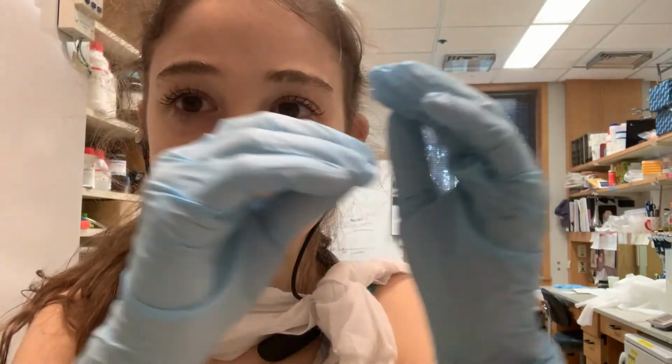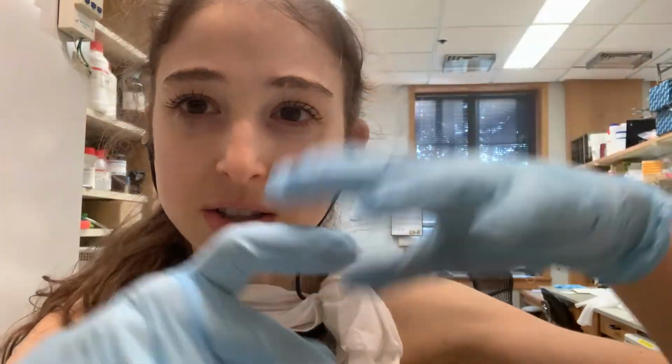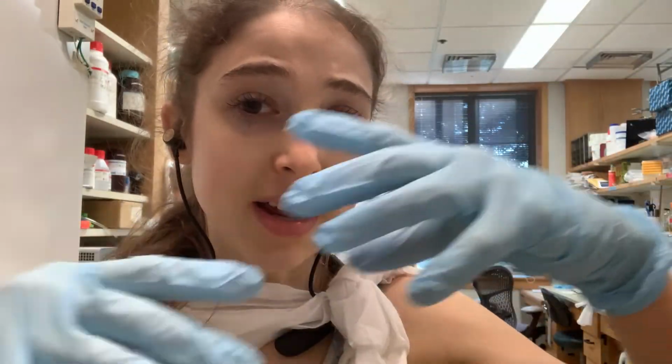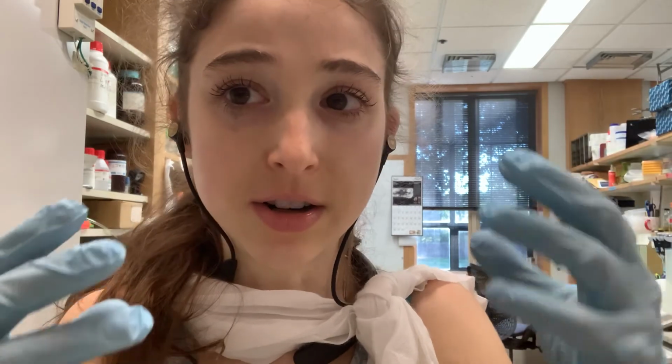You do all that to the DNA recipe for the protein, and then you get the cells in recombinant protein expression, so you stick that plasmid into bacteria and say, okay, make this protein for me, and then I can test and see what effects those mutations had. It's a really powerful way to learn about what parts of a protein do what, and to test ideas about what you think might be going on based on structures, like crystal structures from crystallography that I've talked about. So site-directed mutagenesis is just a really powerful tool.